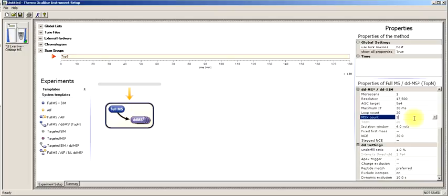So then I would get all the fragmentation of those 2 ions. But as of yet, to my knowledge, there is no way of translating that data for a shotgun proteomics experiment, though multiple groups are working on it. I would expect that to be soon. But here, let's just leave that at 1. Isolation window of 4, yeah, that'll be just fine. You can cut it down to 3 without losing very much sensitivity, but 4 would be just fine.